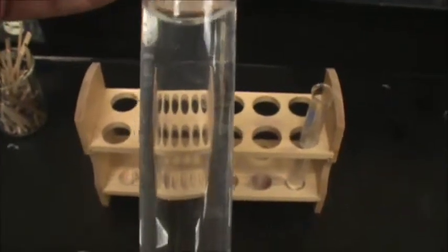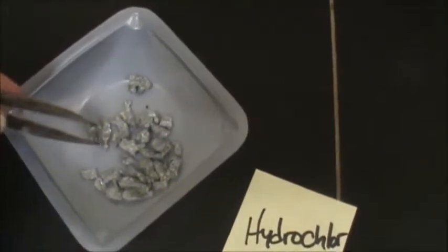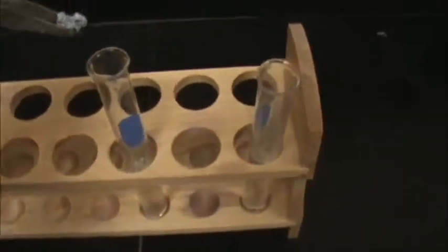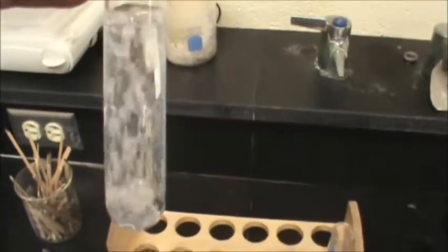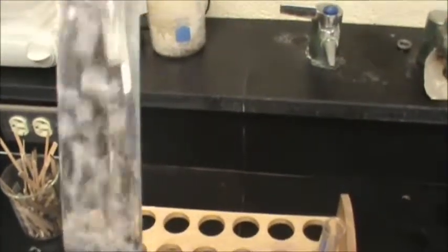Now, what we're going to do is place a piece of zinc into that test tube. So I take my little forceps, take a piece. This is very hard to do with a camera in front of you. There it goes. Bring it on over here, and we're going to drop it in. Let's see what ends up happening. When I drop it in, we immediately start getting bubbles, and it's very vigorous. Alright, so zinc is reacting with that hydrochloric acid very well. We can definitely see an evolution of gas bubbles.